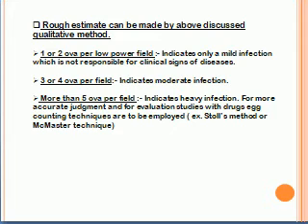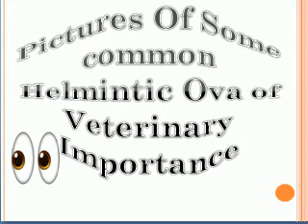So, for more accurate judgment and for evaluation studies with drugs, egg counting techniques are to be employed, like Stoll's method or the McMaster technique. Let us now see some pictures of common helminthic ova of veterinary importance.